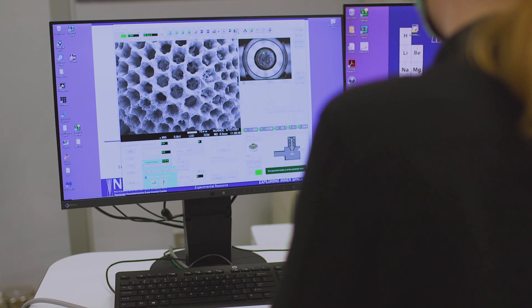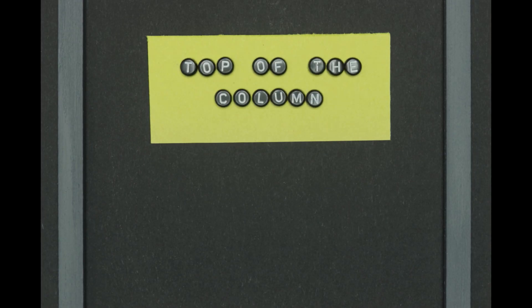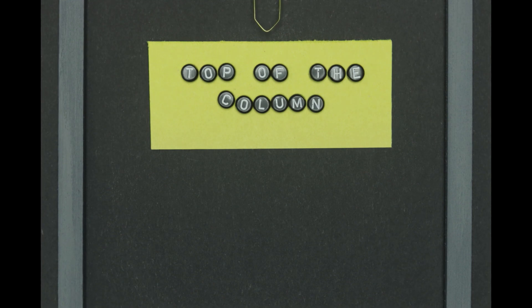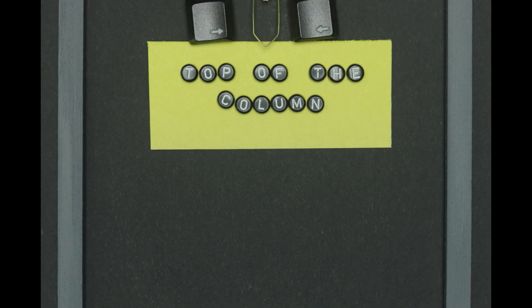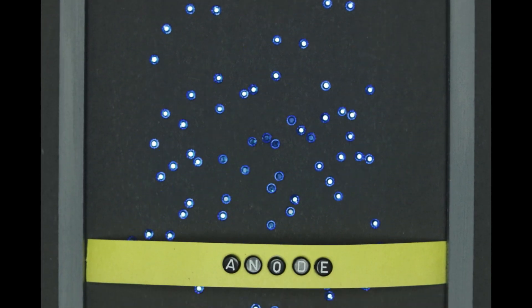So how does an SEM work? It all starts here, at the top of the column. At the top of the column is an electron gun. It generates a lot of electrons. An anode just below pulls all of the electrons off of the gun.